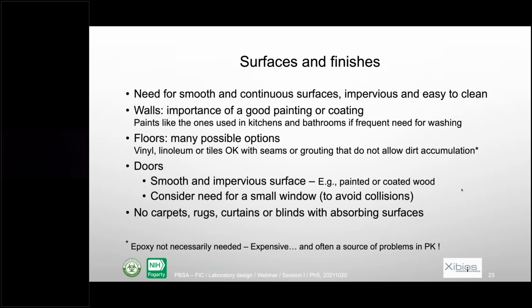Then with respect to the floors, you can use vinyl, linoleum, tiles. These are okay if the seams and grouting do not allow accumulation of dirt. Don't think that you need epoxy. Epoxy is very expensive and very difficult to put in place. And I've seen many situations in Pakistan where people had problems with epoxy. And I can also tell you that in Europe, we don't use epoxy in laboratories, only for large-scale production, manufacturing activities. For the rest, we prefer to use vinyl, which presents a number of advantages.